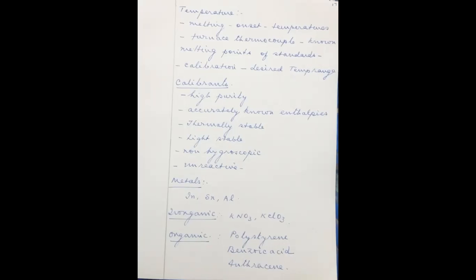Among the metals, indium, tin, and aluminium are the important ones which can be taken as calibrants. And also the inorganic substances, potassium nitrate and potassium chlorate, can be taken.